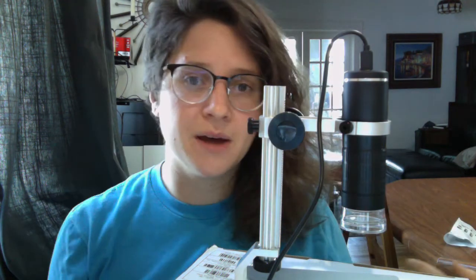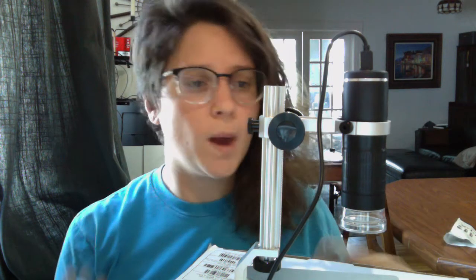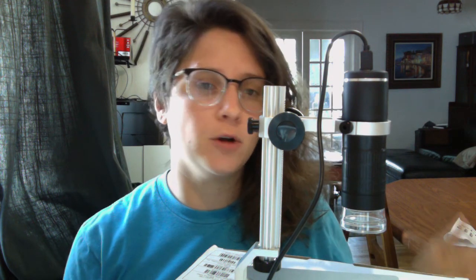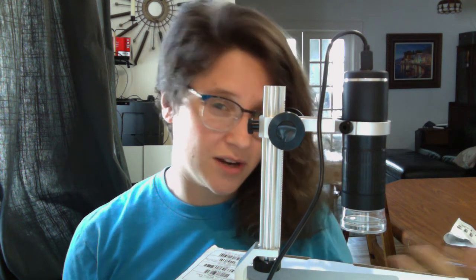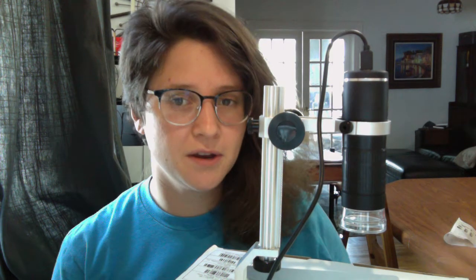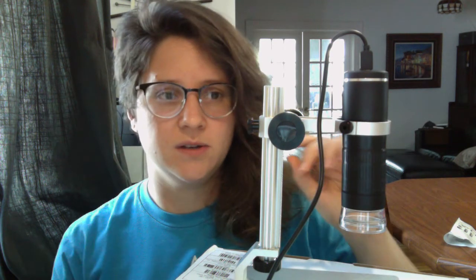Compared to the last model, the Celestron, this one is not as well-made feeling — it's a little bit shakier. But you're looking at almost 50% of the price of the Celestron. The Celestron might be better for professors looking for a model to do their own videos, but I think this is a better price point for undergraduate students.